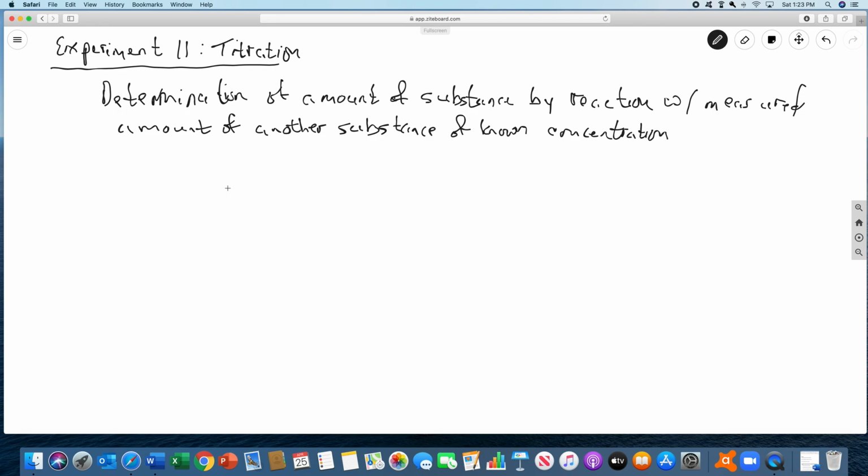So the ultimate goal of this experiment is actually for part C. In part C, you're going to be given an amount of hydrochloric acid and you don't know the molarity. So molarity is question mark. You're going to react it with sodium hydroxide, which will of course form sodium chloride and water. Here you'll have a molarity and you're going to measure a volume, and then you'll have a volume and a molarity, and then you can use this to get to moles of this. You'll know the volume, you're going to use 10 mL.